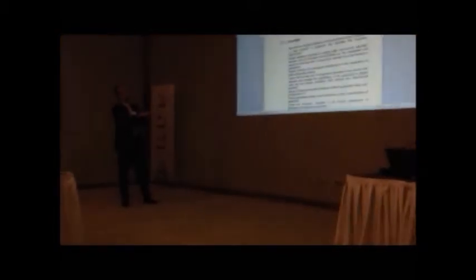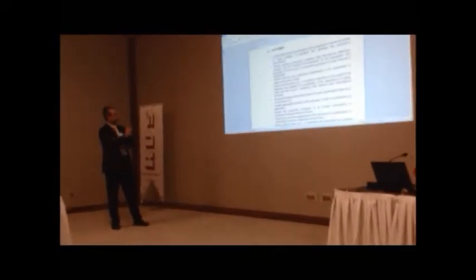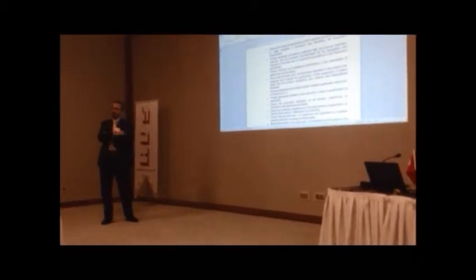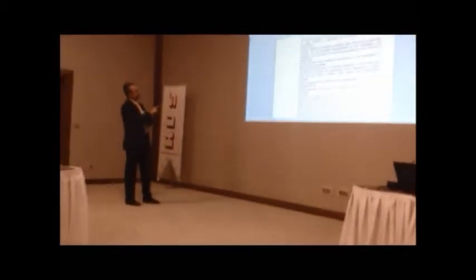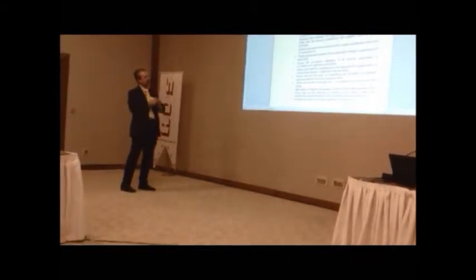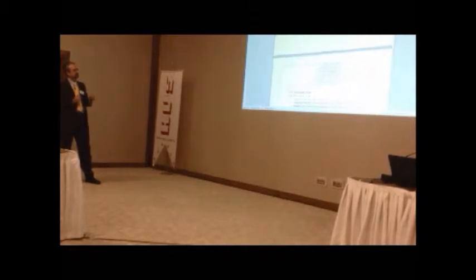Review and approve the protocol, provide material. Yes, in this case, the calibration was made by themselves, and we were just checking that the calibration was made. Review the results of the test. Approve the report and the final summary qualification. Our responsibility.